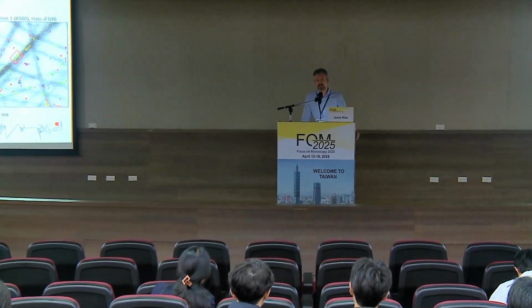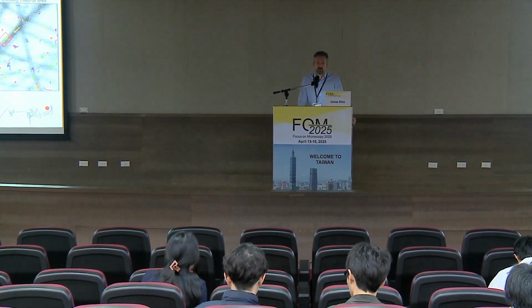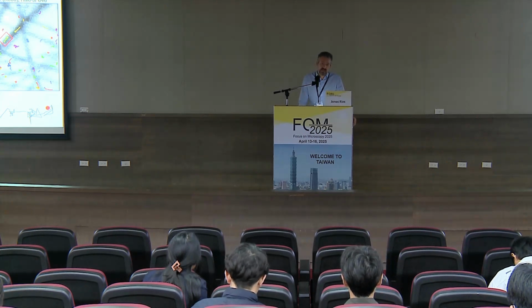So yes, we do this with our ratiometric dual color imaging in fixed cells using Alexa 647 and then maybe CF660C or another of these far red dyes, where we get a good 3D resolution in 2 colors. And we spent quite a lot of time also looking at AP2, for example, together with clathrin. In the end, it turned out to be not so easy to get high labeling efficiencies in that case.